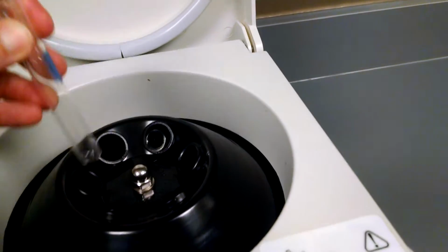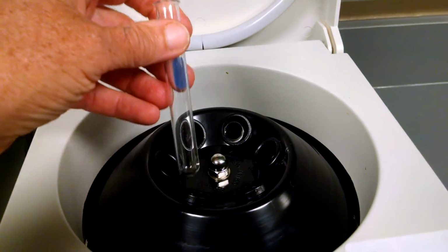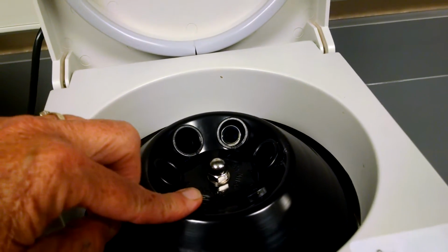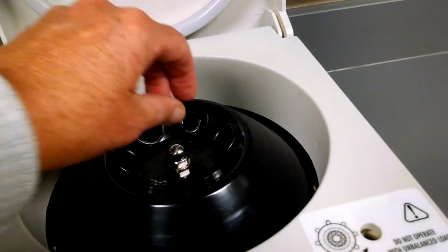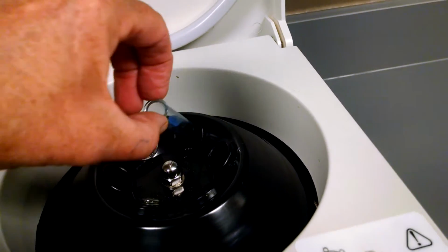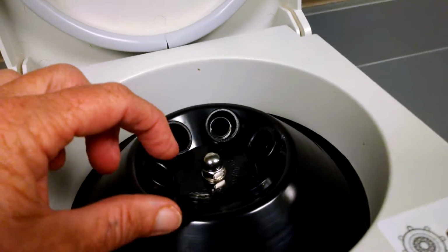When you use the centrifuge, what we want to be sure of is that we have it balanced. So if I put my test tube in this well right here, I should have another group that puts theirs over here, and we want there to be approximately the same amount of liquid in there. So we'll just check that out, make sure they have about the same amount of liquid when we put them in. And then these are all labeled.